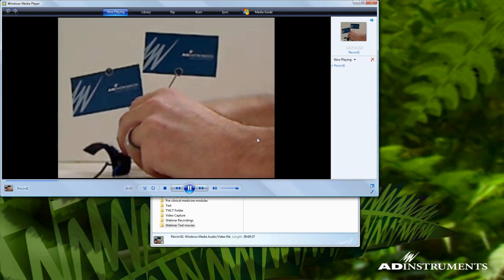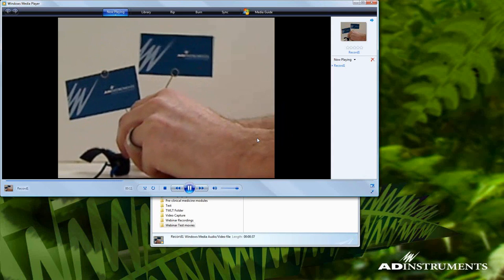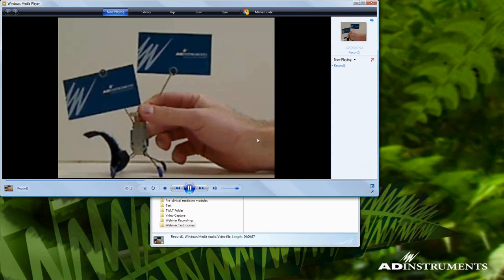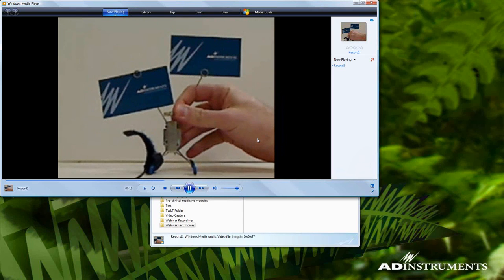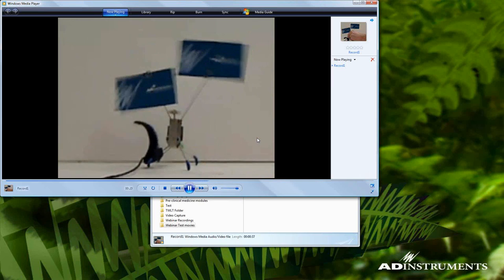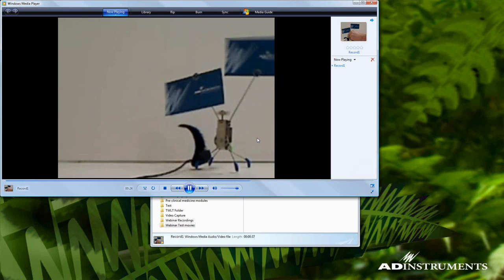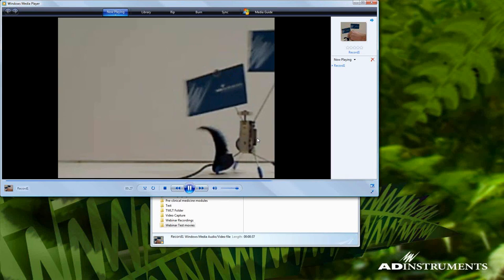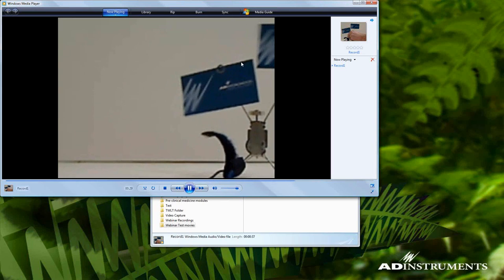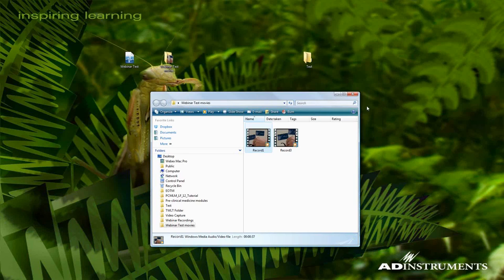You'll see here, like I said, I've deleted that data out of the data file that corresponded to me winding the device here, but it does not delete it out of the video. So it doesn't need to perform any sort of video editing at all. It'll just change how LabChart marks and syncs to the video. So we'll go ahead and close that.